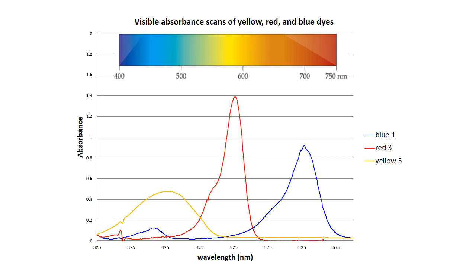So the color that you see is not the color of light that is absorbed. And the reason is because as white light travels through the dye, some color is absorbed. And then what remains comes to your eyeball. It is what's left from the white light, right? So the color that's absorbed is not the color you see, right? It's the complement actually of the color you see.